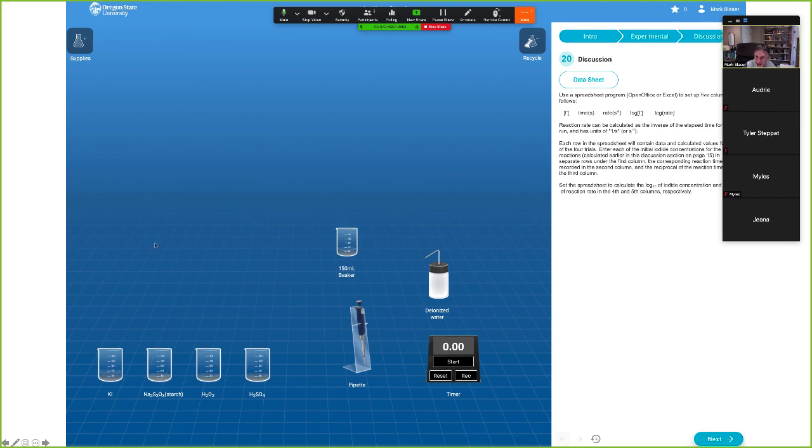And so you'll have some beakers that you'll add some of these substances to one flask. You'll add some of these substances to one flask, some to another. You use the pipette. You have to do the normal pipetting technique, change the tip, make the amounts what they ask for, etc. And then when you're ready, when everything's been pipetted, you'll take one flask and add it to the other. And it's kind of weird. You actually just place one flask on top of the other. And then that indicates that they're poured and mixed. And when you do that, this timer will start.